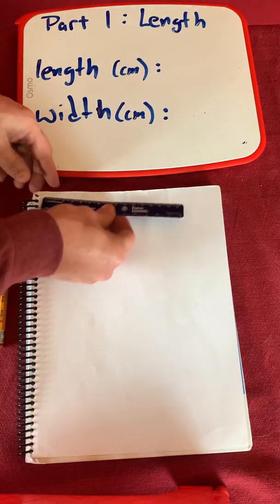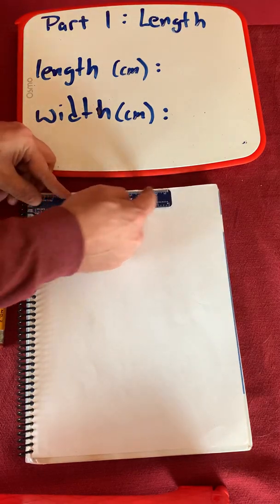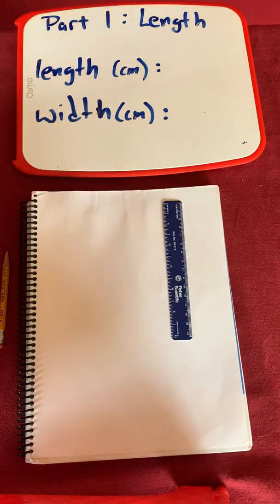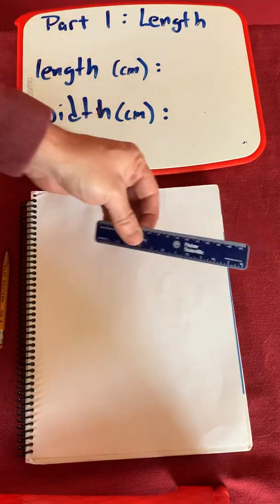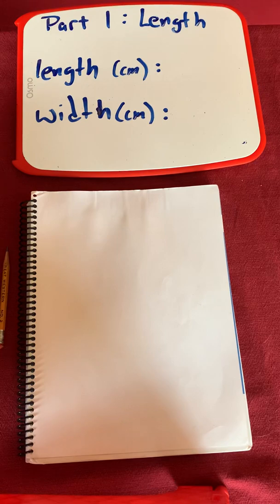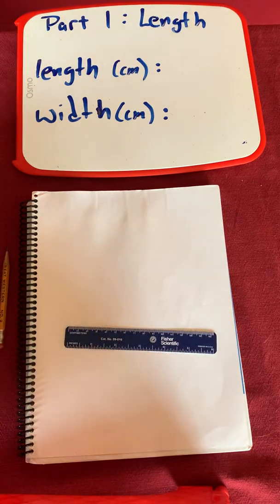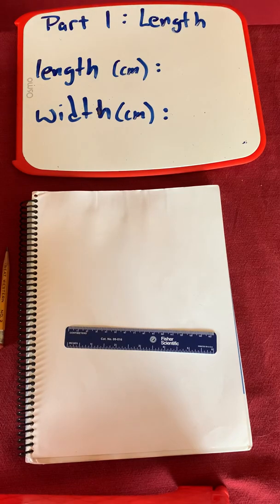Now, ideally, if I was going to do this measurement, I want a measuring device that stretched the entire length of the object that we wanted to measure. You can see that this ruler falls a bit short in both dimensions. We're just going to mark in the middle and then continue to measure and add up our two individual measurements. This does introduce the possibility for some additional error, but if we're very careful, we should be able to minimize that.